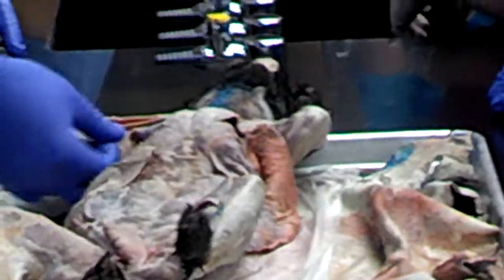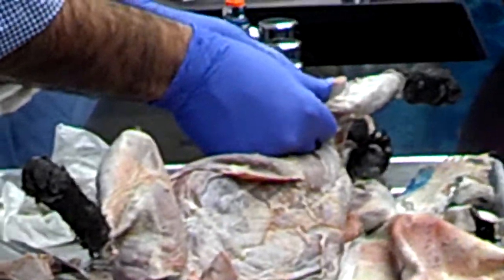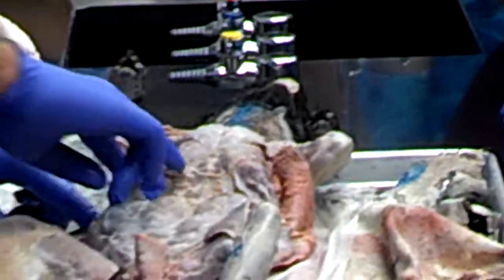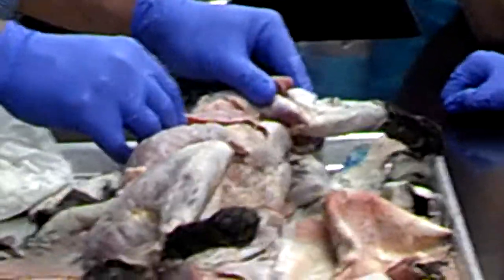Let me go over quickly again. Chest muscles: xiphihumeralis, pectoralis minor, major, pectoantebrachialis, clavobrachialis or clavodeltoid, epitrochlearis, a very thin muscle, long head of triceps, lateral head of triceps, medial head of triceps, external oblique, internal oblique, rectus abdominis, linea alba, latissimus dorsi. Coming down here, this muscle is sartorius, gracilis.